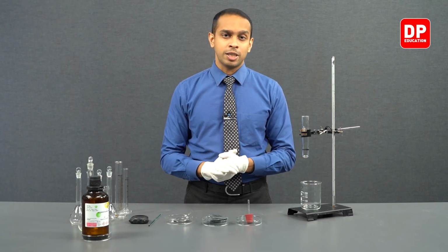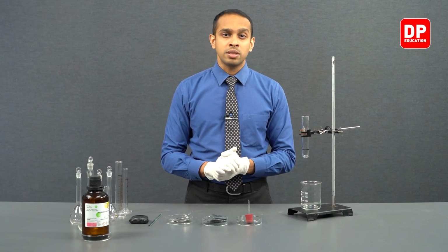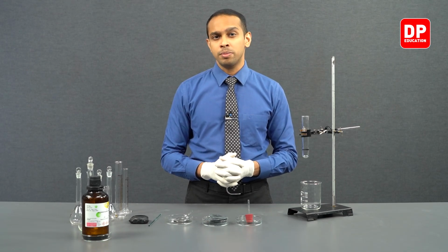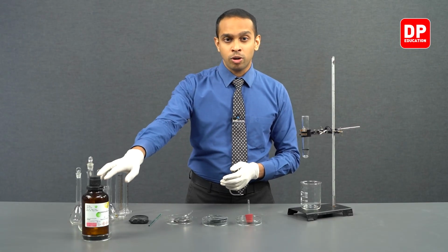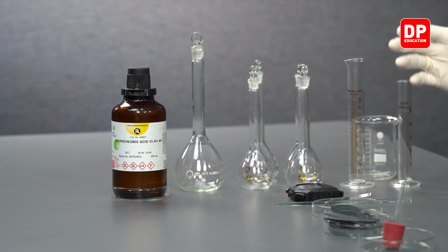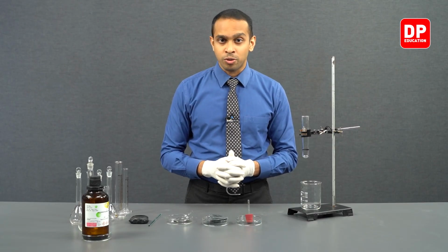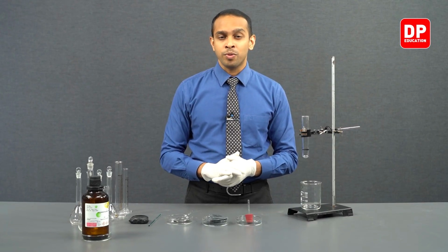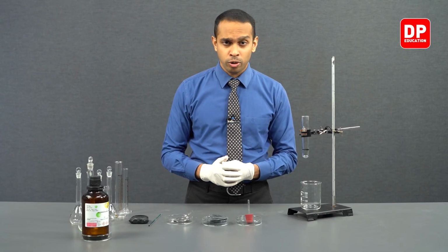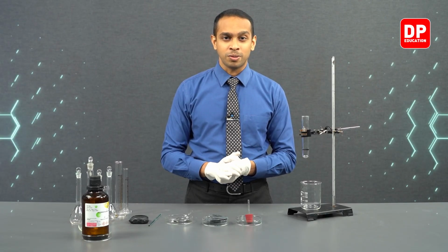In the first part of our experiment, we are going to be preparing HCl solutions with different concentrations. So let's move on to the first part of our experiment, where we will measure a specific volume of HCl from our stock bottle, and we will proceed to prepare HCl solutions with different concentrations ranging from 1 mole per decimeter cube concentration all the way down to 0.2 moles per decimeter cube concentration. Let's move on to that part now.